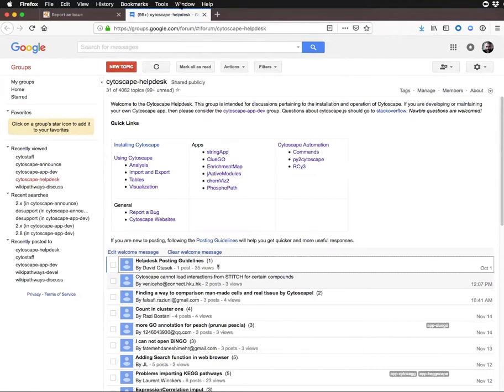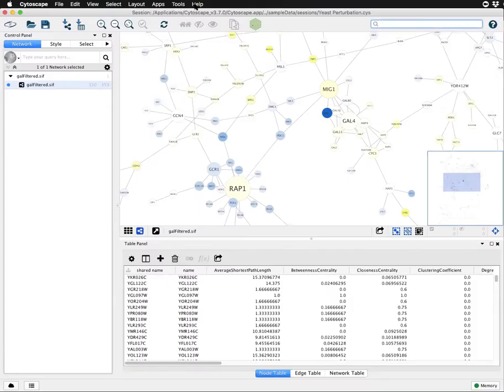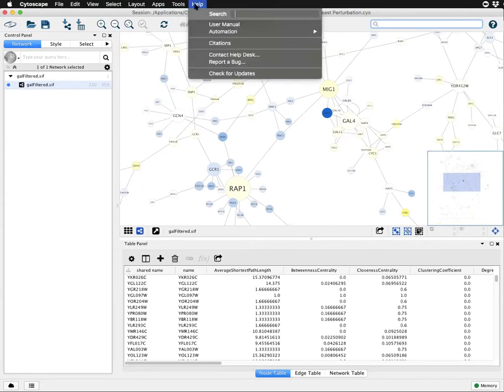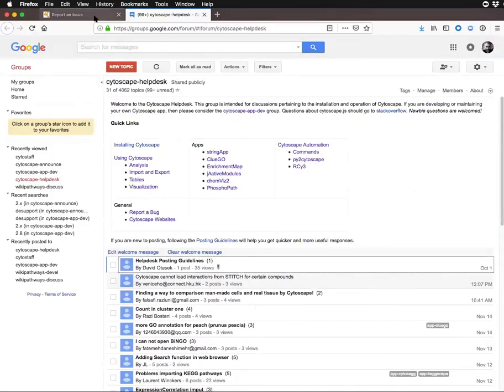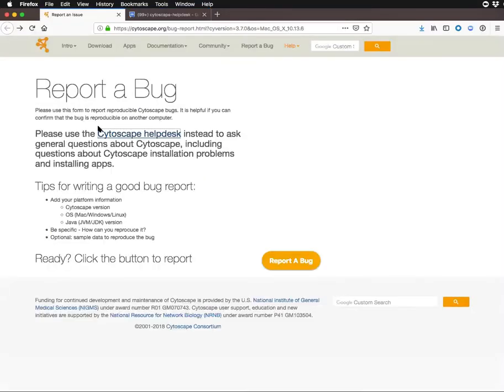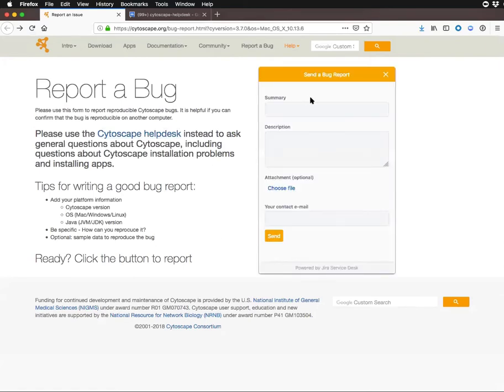If instead something seems wrong in Cytoscape, you can also report a bug. This will take you to a different web page where you can click Report a Bug and fill in information about exactly what's going wrong.